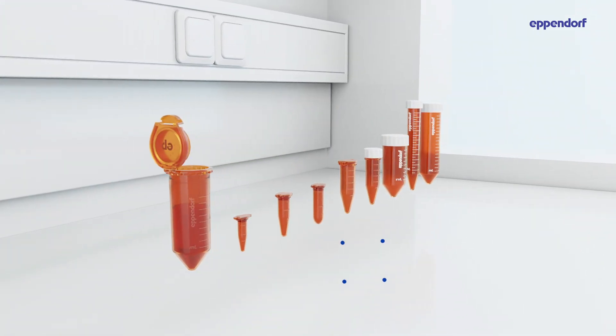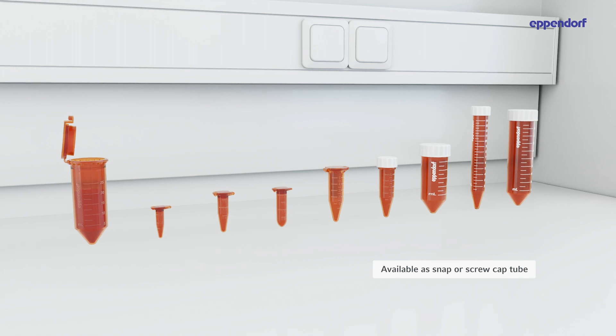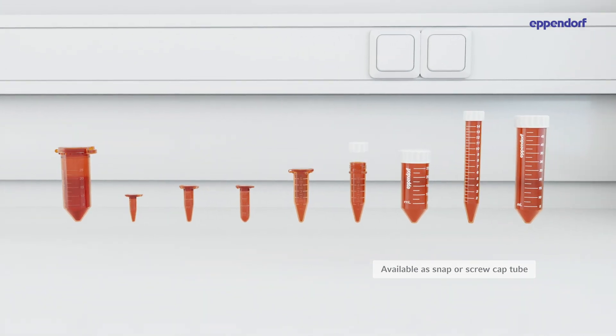Eppendorf amber-colored tubes are available as safe-lock tubes and conical tubes, with snap or screw cap. Choose your format carefully.